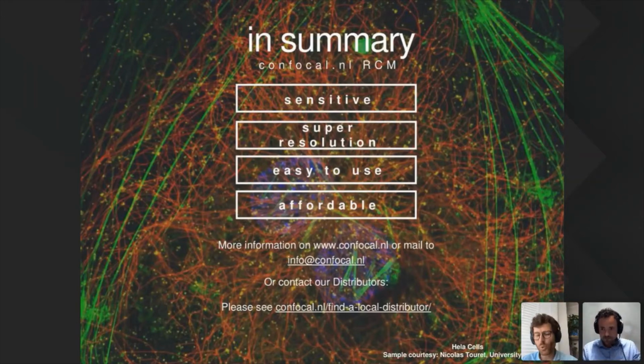Adding the multi-split will not change anything for that. Basically, when we use a CMOS camera, it's not a true global shutter, so I don't think it makes any issue.